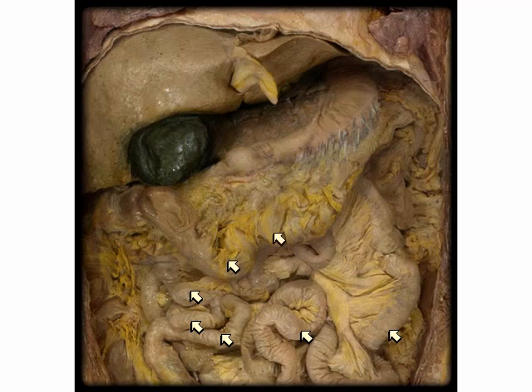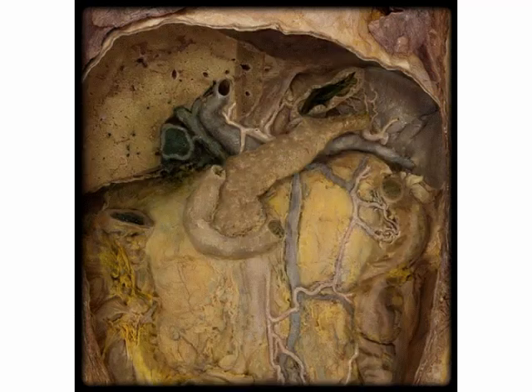All right, if we remove all of the intestine and the stomach, here's the stomach right here. On the next slide, we removed also that gallbladder and portions of the liver. But now you can see the pancreas. You might have wondered where we're going with that. But now you see the pancreas. And I'll draw a line around the pancreas.